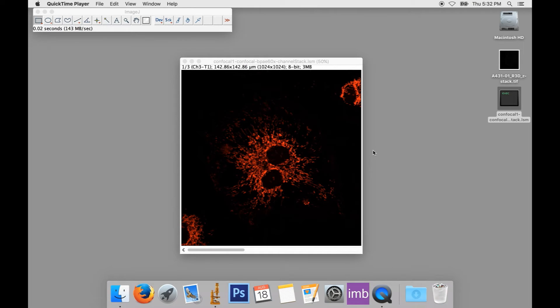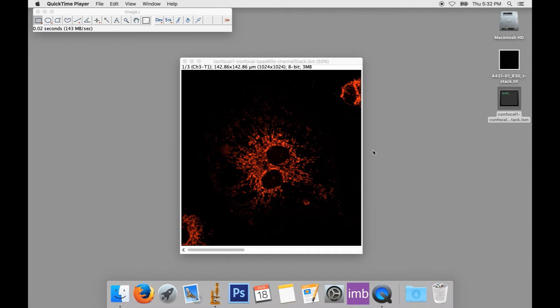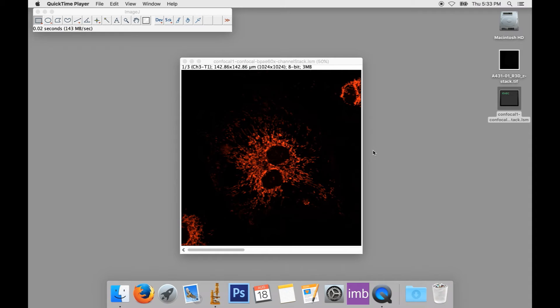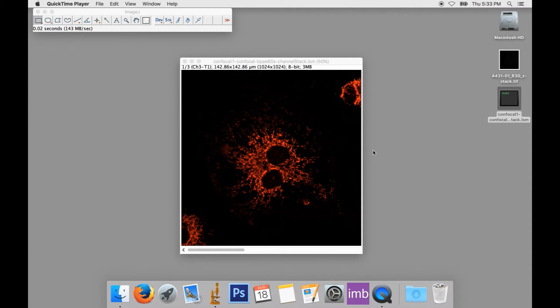The answer is, we use an image stack—multiple images displayed sequentially in the same window. If the images were collected sequentially through the depth of an object, that stack is called a z-stack. If the images were collected sequentially through time, the stack is called a time-lapse. Stacks of images representing different colors viewed through the microscope can be put together as well and are called lambda stacks. The lambda stands for wavelength. A greatly simplified version of this is a stack with a few images taken at different wavelengths, representing discrete channels of information.